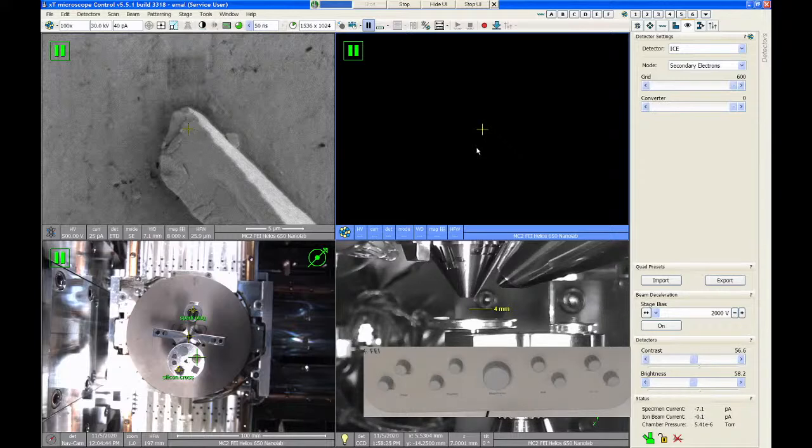Okay, that sounds good. Yeah, so for the FIB one, are you going to use it on the same instrument, like showing on the same instrument, this one? Yeah. Okay. Yeah, I'll go over how to use the FIB, how to use the gas injectors. I was going to demonstrate how to do a cross-section cut, which will hopefully be useful for what you want to do, and then also probably do a TEM sample. Okay, cool. But I just have two more quick questions. Yeah, go for it.